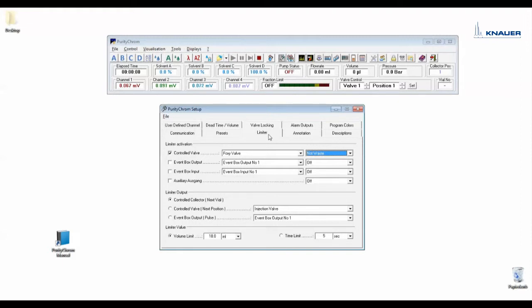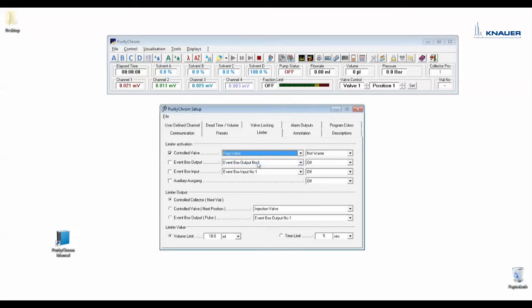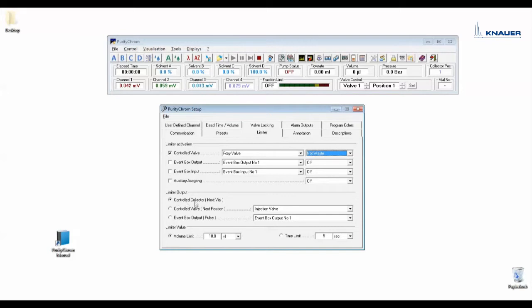The limiter is a special feature of the software which calculates the pump volume. Under limiter activation you can choose when the calculation should start. In case we have a fraction collector you would enter here the valve of the fraction collector. It should start if the valve changes the position from waste to fraction, so we enter here not waste. After a special volume which you can enter here or a special time the collector should perform a step to the next vial. So we enter here controlled collector next vial.